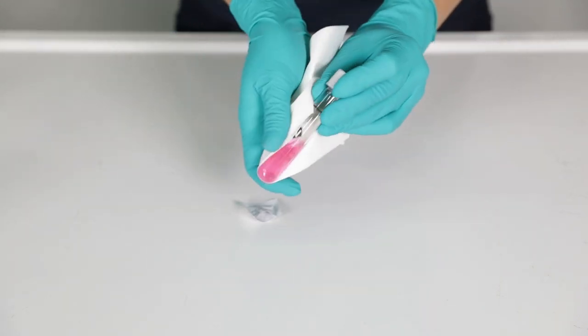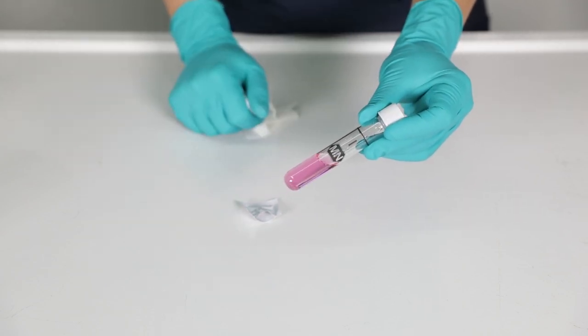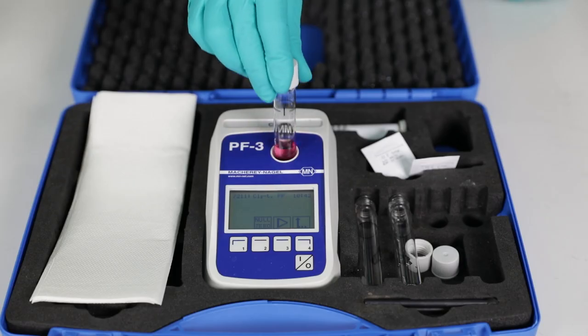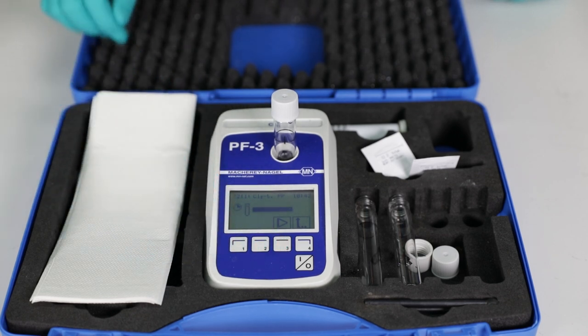Ensure that there are no fingerprints at the outside of the cuvette or gas bubbles on the inside. Insert the cuvette into the photometer. Wait for two minutes reaction time and determine the chlorine concentration.